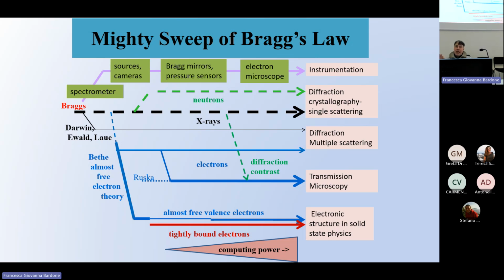But when you use electrons, usually you have small objects. If you have bigger objects, you can use X-rays to do crystallography. X-rays interact less strongly with matter with respect to electrons, and you can have a 3D reconstruction of an object using X-rays. In X-ray crystallography, we can reconstruct the crystal, and the crystal could be of the size of a few millimeters.